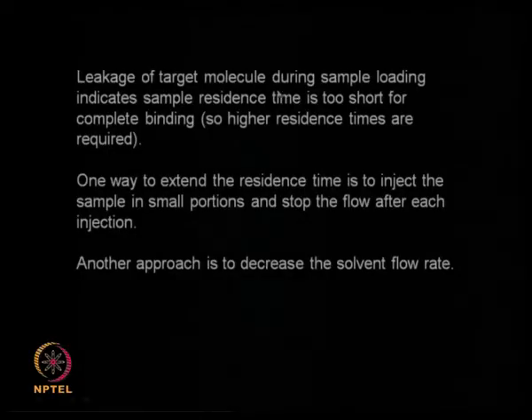Leakage of target molecule during sample loading indicates the sample residence time is too short for complete binding, okay. So slowly the target molecule is coming out, that means you are not giving enough time for the ligand and the protein to interact. One way of addressing this is to inject a little bit, stop the flow, then inject again and stop the flow, okay. So multiple small injections, that is one approach.